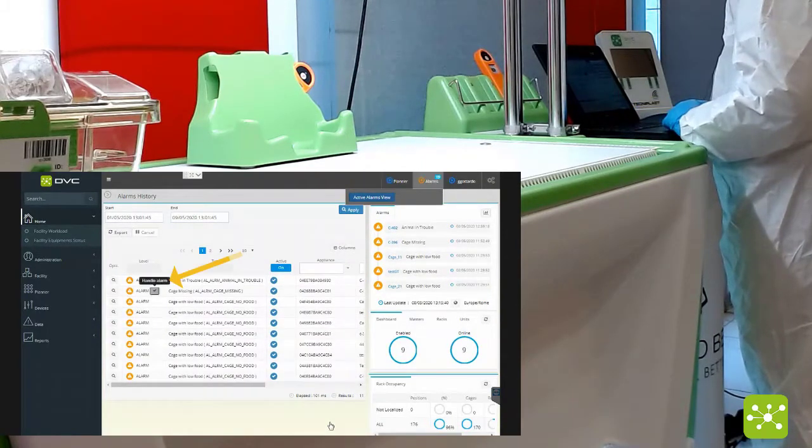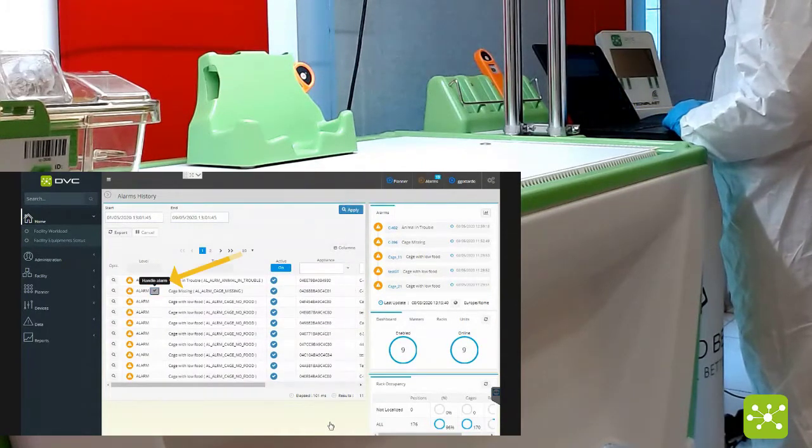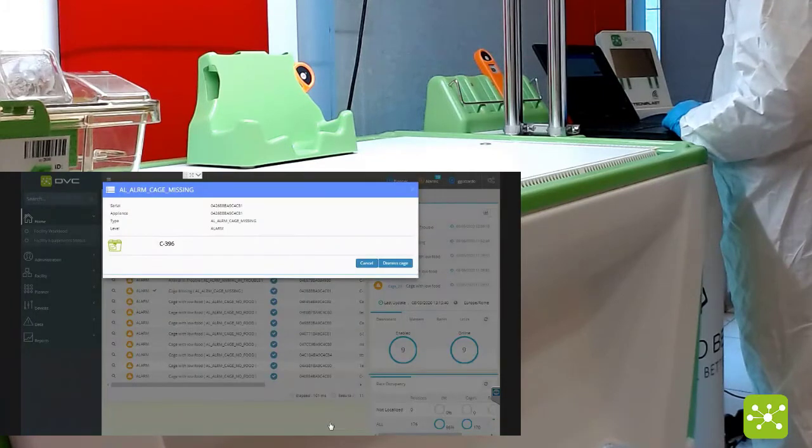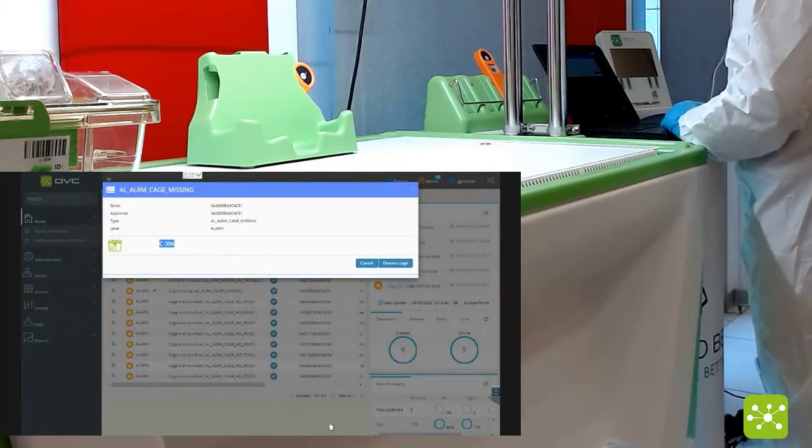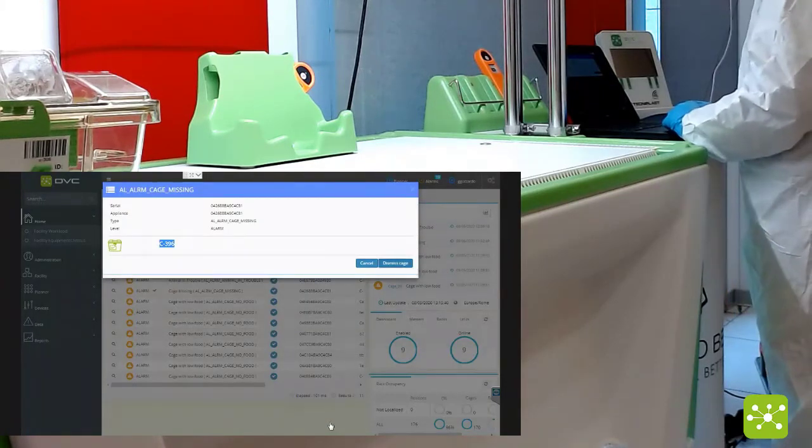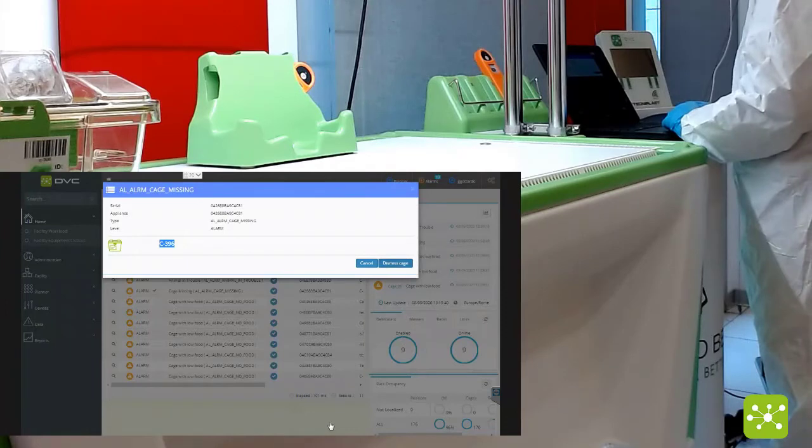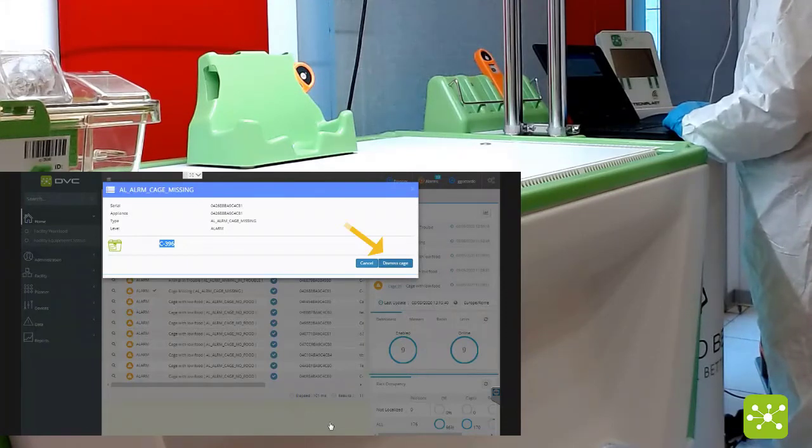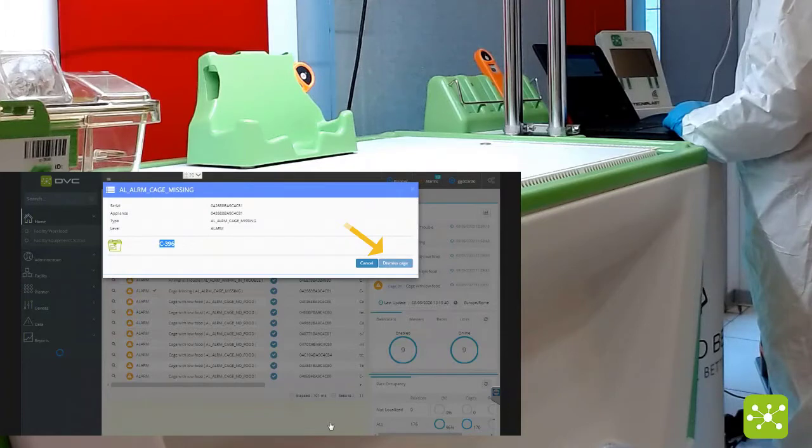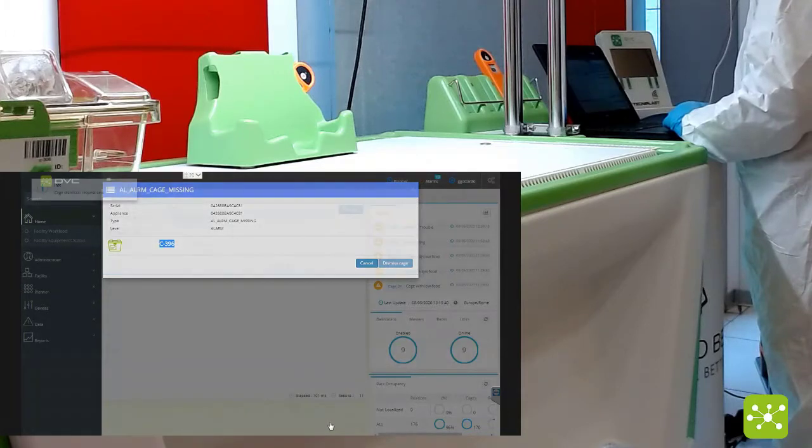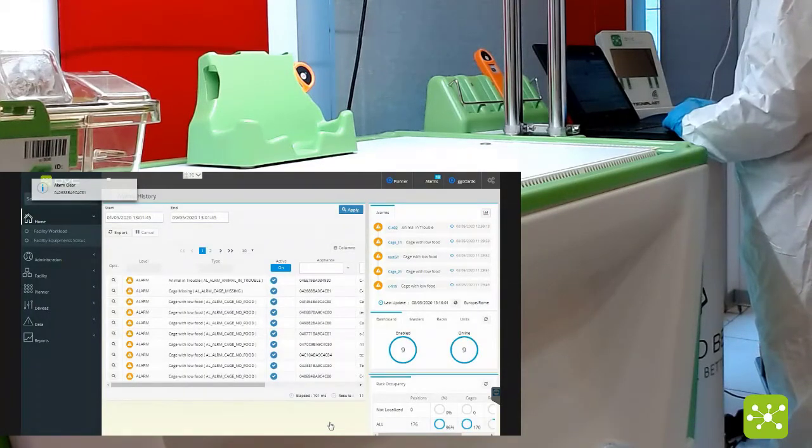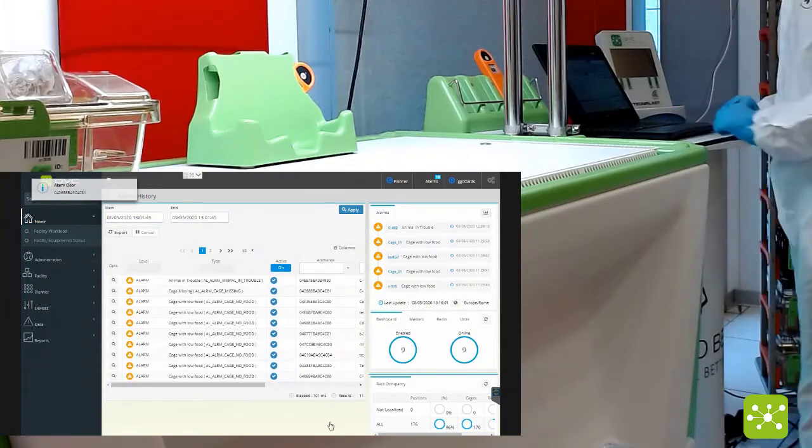You can click on this alarm and the system will ask if you want to finally terminate this cage that is currently missing. If you confirm, this cage will be automatically terminated.